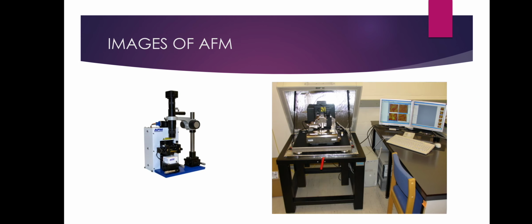So let us look at some of the images of AFM. The image on the left side is an image of an AFM, and on the right side you can see the setup of an AFM. This device is the AFM, which is connected to a computer or any electronic device, which gives us the image of the sample surface.